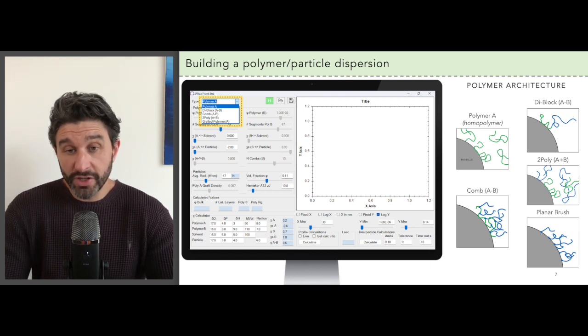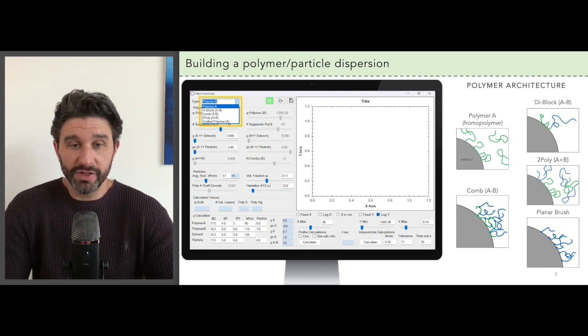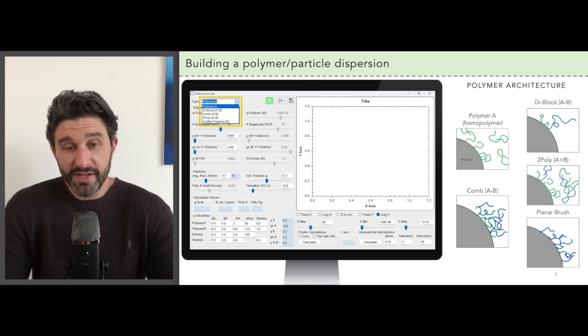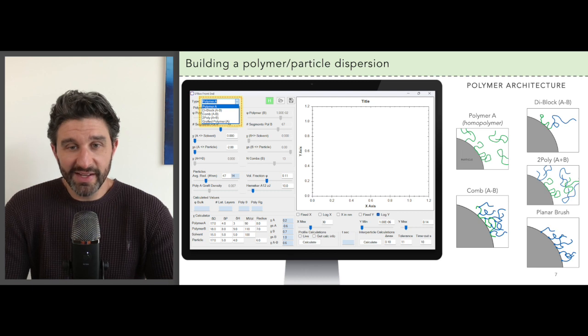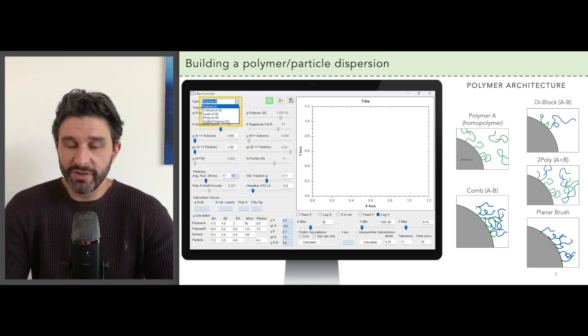There's also the option for a comb polymer or a two polymer system, which is actually a blend of two different polymers within the solvent around the particles. Finally you have a grafted polymer, aka a polymer brush, and this is when the polymers are actually tethered chemically and permanently to the surface of the particles.